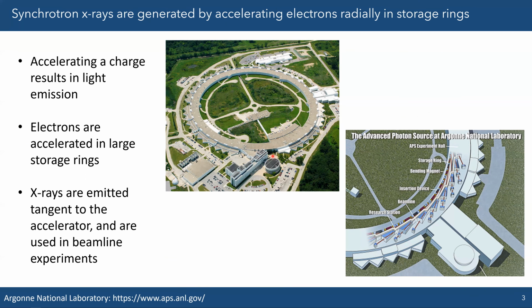The Argonne National Lab has the Advanced Photon Source, APS, where you can submit your proposals. You can also do it at SLAC at Stanford. These beamlines are open for public research use. They'll dedicate time to you. You don't need to pay for the time there, but you do need to write a proposal, let them know why you want to do it and why it's useful, and have the proposal be accepted. Then you can run your beamline experiments at Argonne or Stanford for free.